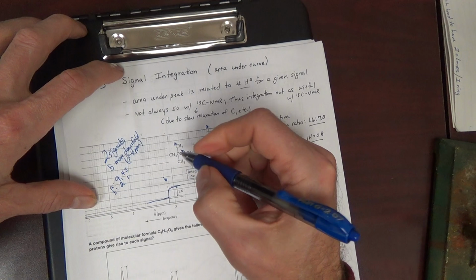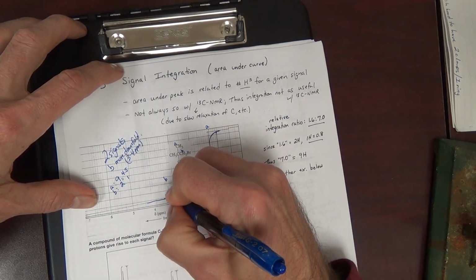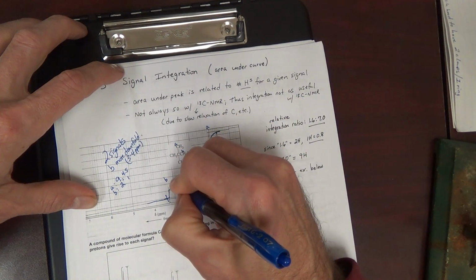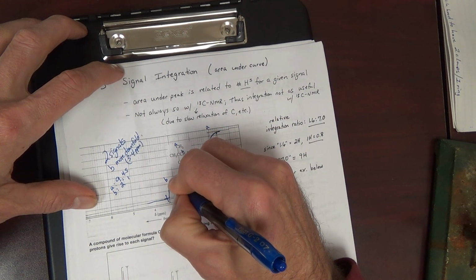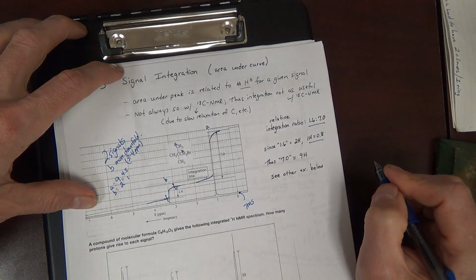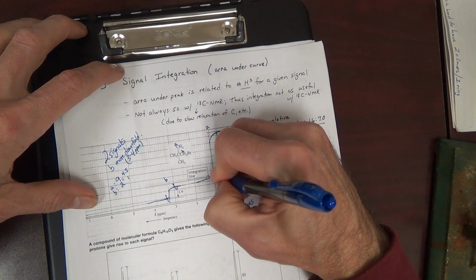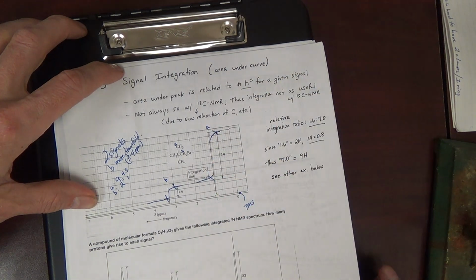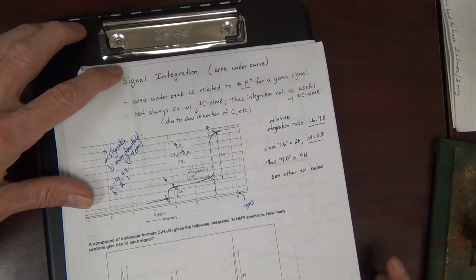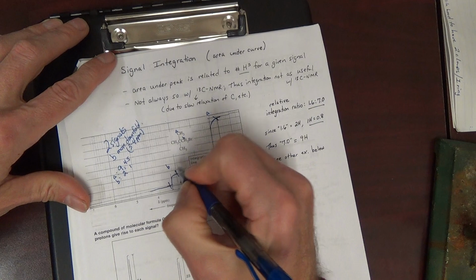Basically you chop that line from where it starts rising to where it flattens out. Boom and boom. And then you measure that, all right?